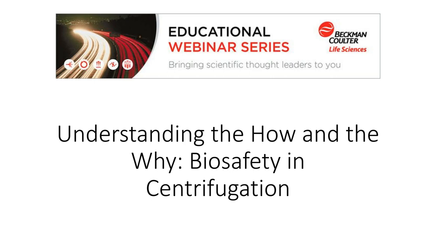So, of course, after something like that, wipe that up. But I would say good practice is just to keep an eye out for when that is needed, but you shouldn't have to do that every run. I think it's better just to set a regular practice. Every week, for instance, check on the various things that need to be checked. All right, thank you.